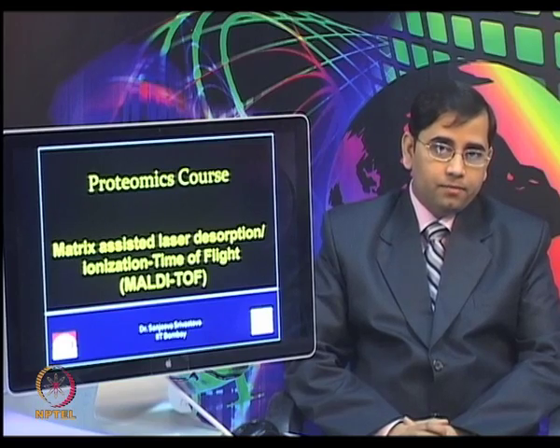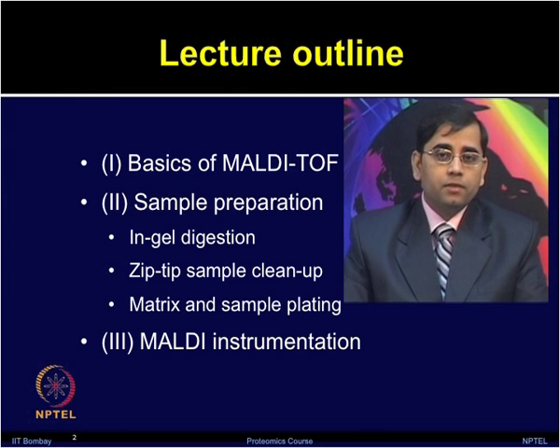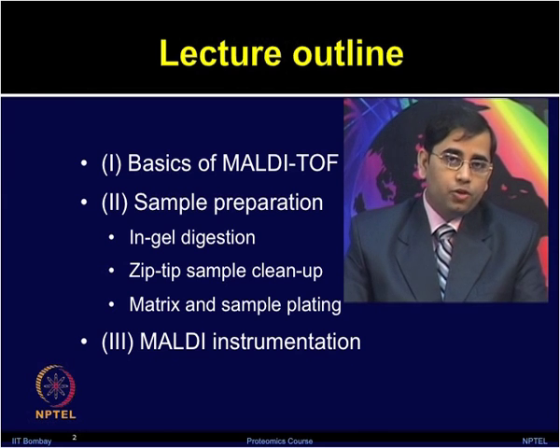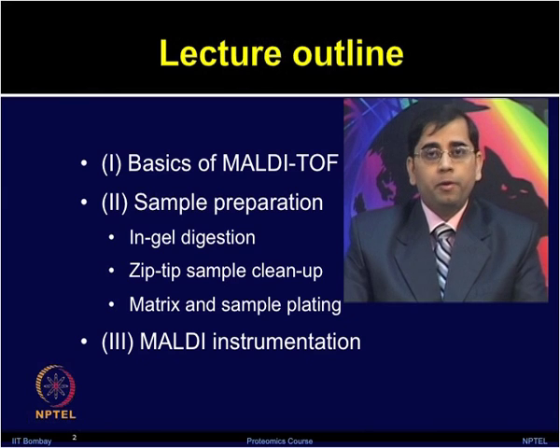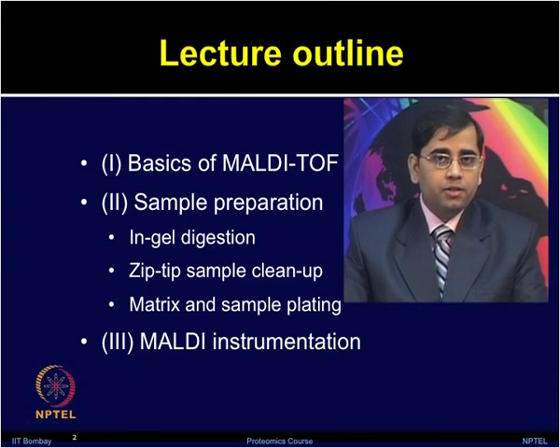modification studies. So, in today's lecture, we will talk about the basics of MALDI-TOF, how to prepare the sample for MALDI-TOF or TOF-TOF analysis, which will include in-gel digestion.